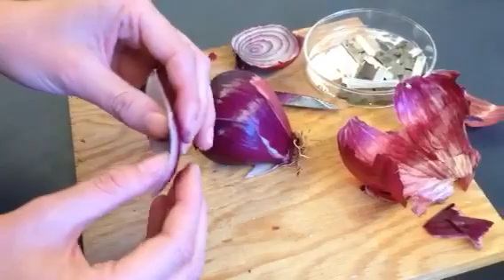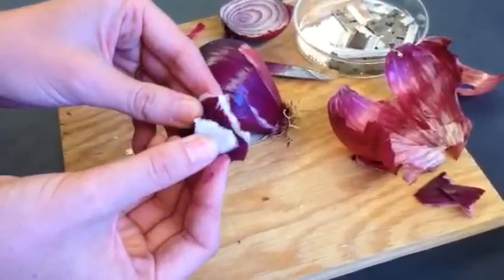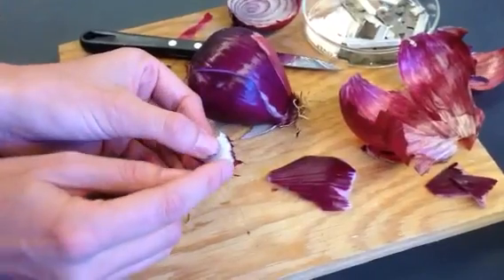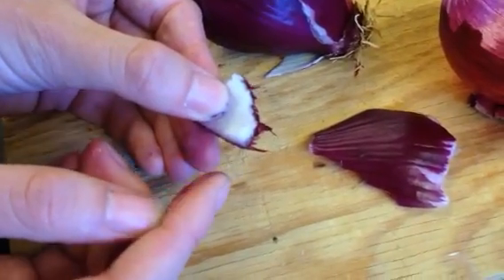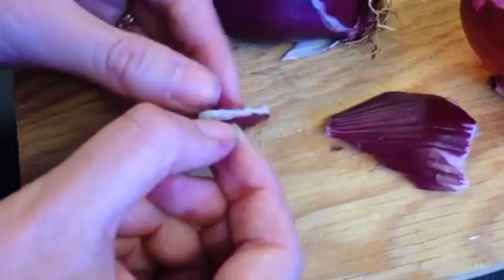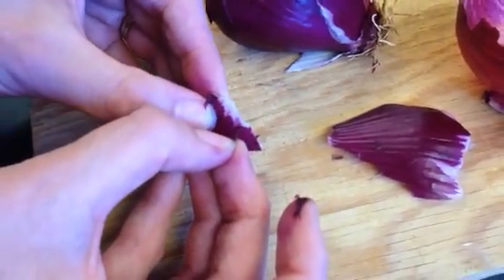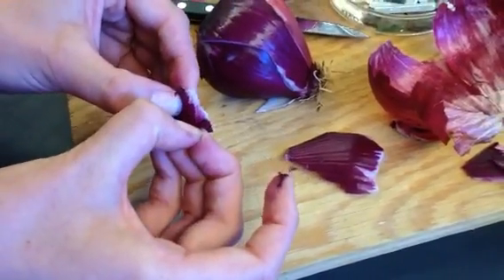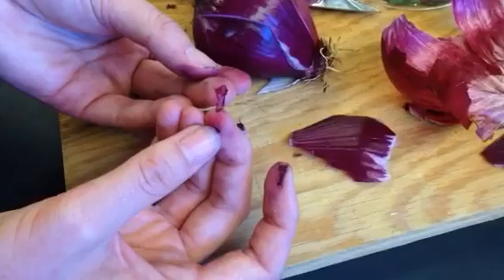You want the thinnest piece possible. To do that, you're going to break the pulp and then peel back. What you really want is this thin purple stuff you see hanging off of this white pulp. You can use your fingernails, a razor blade, or even some forceps to continue to peel that back off of the onion, so you get one very small, very thin piece of onion skin.